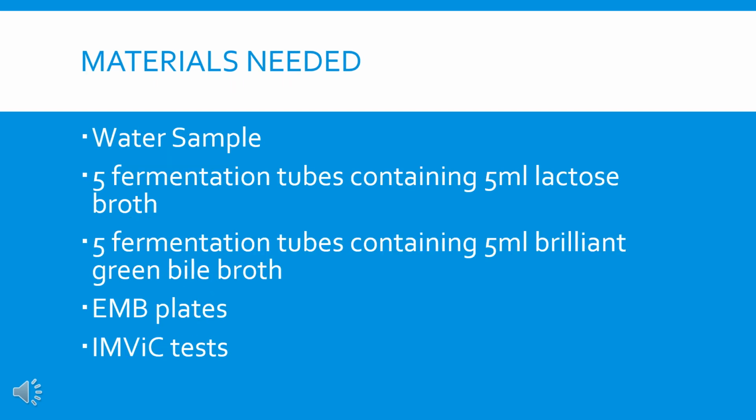These are the materials we need for this experiment. Your water sample, of course. We have your 5 fermentation tubes containing your 5 ml lactose broth, your 5 fermentation tubes containing 5 ml brilliant green bile broth, your EMB plates, and your IMVIC test.